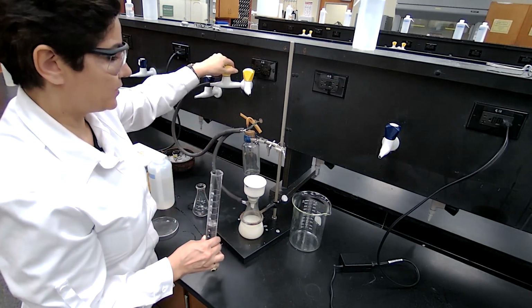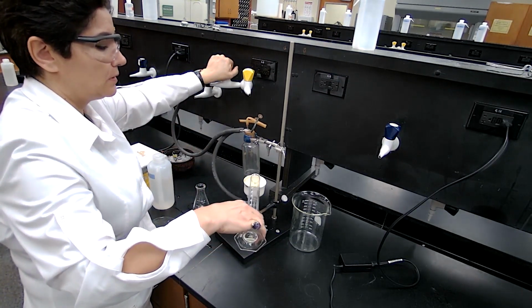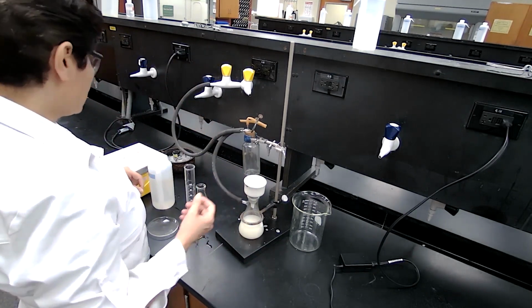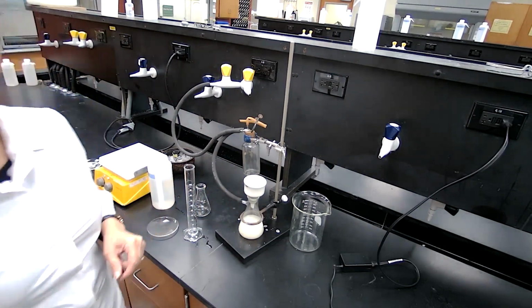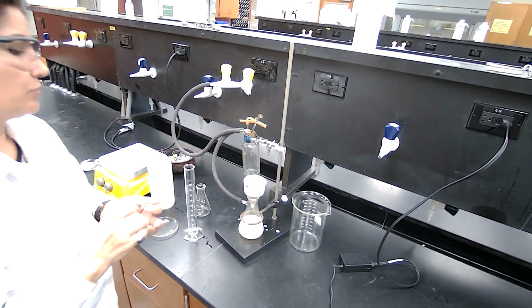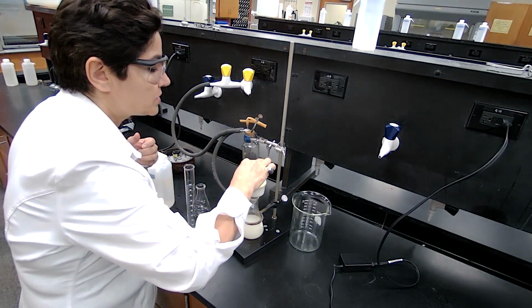So I close the vacuum, add water, wait for maybe 30 seconds to a minute. And with the stirring rod, you can sometimes mix it also, just making sure that it is going to mix well and wash well.